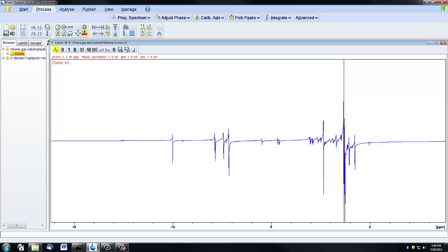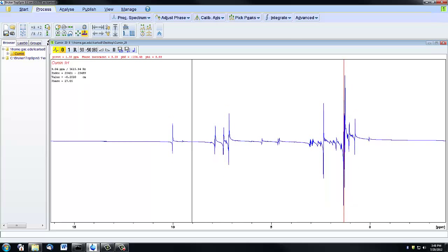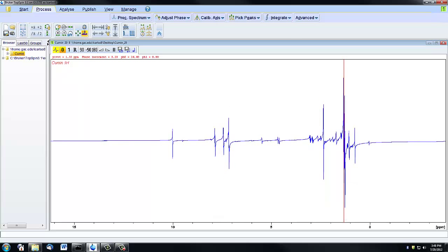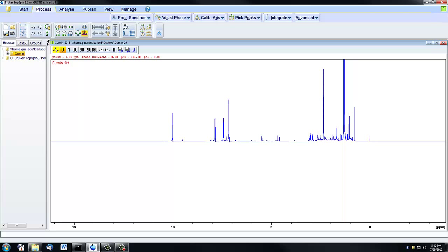The first step of manual phasing is to do a zero order correction, which is done using this zero icon here. If you click and hold on the zero and then move your mouse upwards and downwards, you'll see that the baseline is moving, and it's moving most dramatically in the immediate area near the red line. The goal of the zero order correction is to get the baseline as smooth as possible in the area of the red line. We're not going to worry about what the baseline looks like on the left or the right, just right around that red line. Once it looks pretty straight, you can move on to the first order correction.